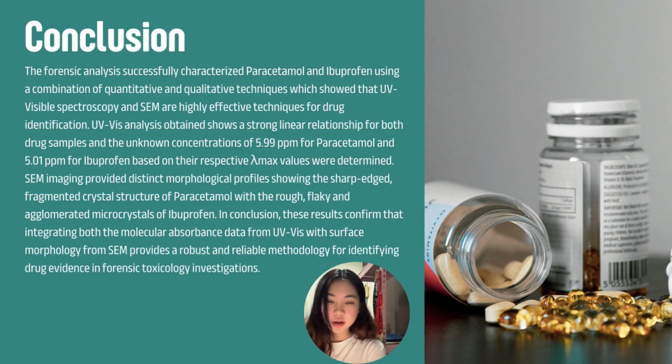To conclude, the forensic analysis successfully characterized paracetamol and ibuprofen using a combination of quantitative and qualitative techniques, which showed that UV-visible spectroscopy and SEM are highly effective techniques for drug identification. The UV-Vis analysis showed a strong linear relationship for both drug samples, and the unknown concentrations of 5.99 ppm for paracetamol and 5.01 ppm for ibuprofen were determined based on their respective maximum peak absorption values.